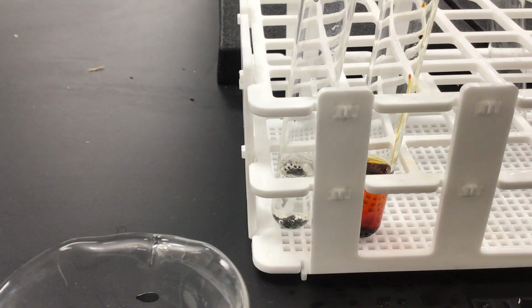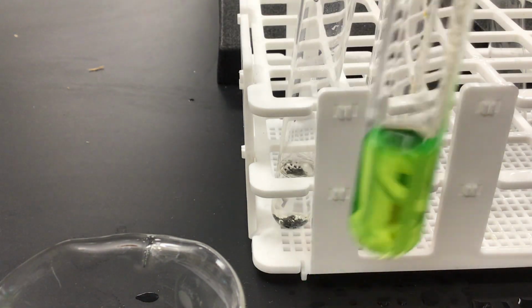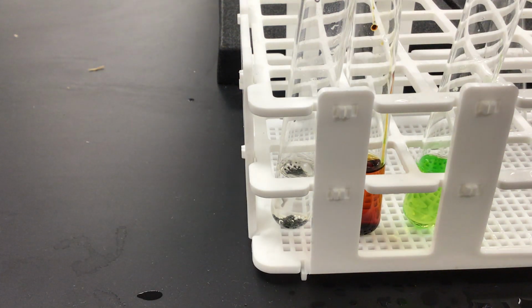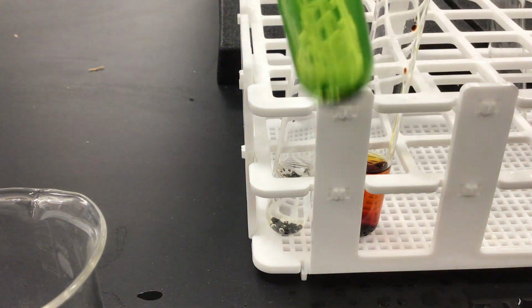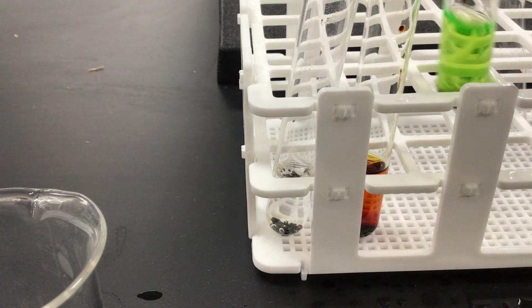Ethylene glycol is a green liquid, also known as antifreeze. And a few crystals of iodine. And the ethylene glycol just sinks to the bottom, no color change.